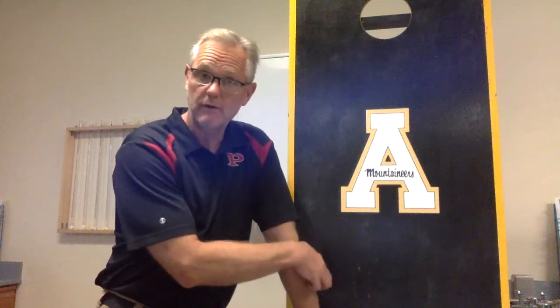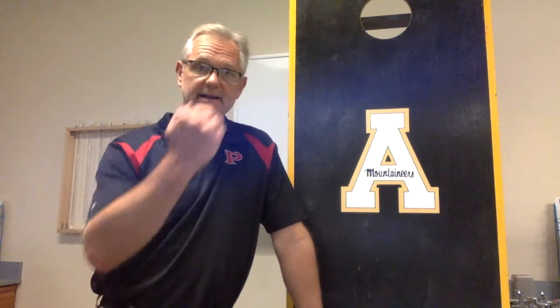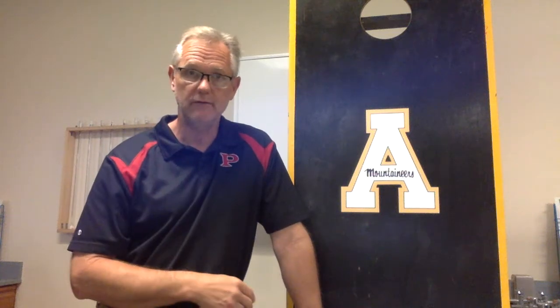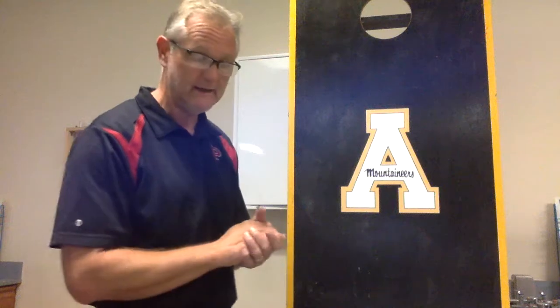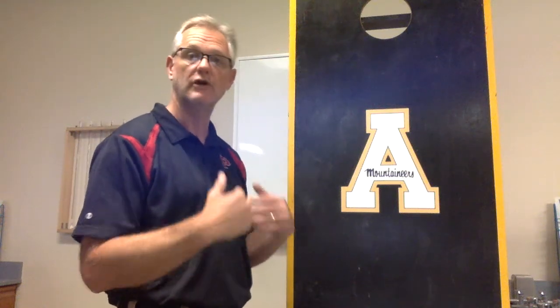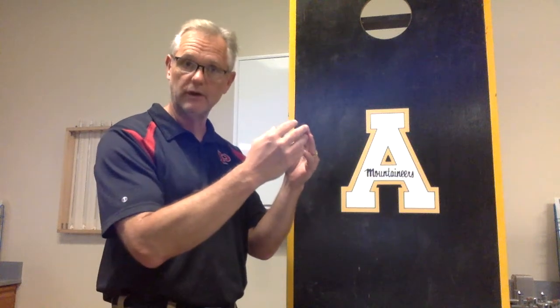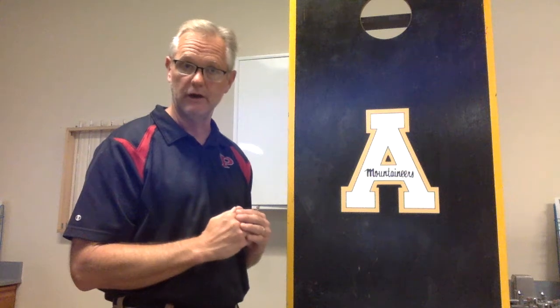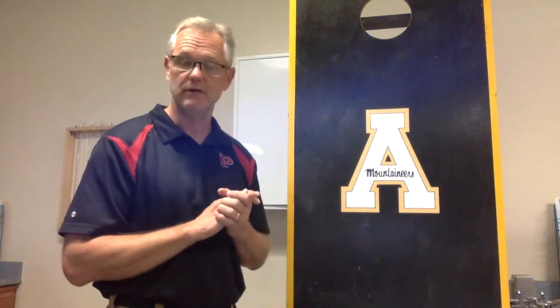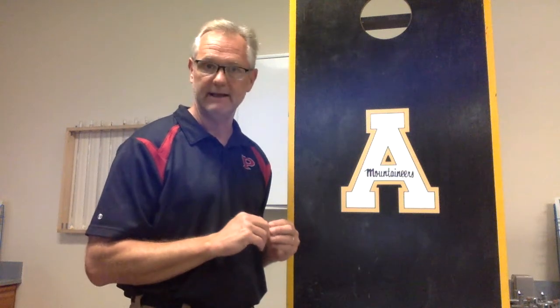Okay, in this lab, we're going to focus on the energy that is released as the electrons move from energy level to energy level. We're going to use a Bunsen burner to supply that energy to make the electrons move up in energy levels. And then those electrons will naturally fall back down. When they fall back down into these lower energy levels, they release energy, and the way they're releasing this energy is as light energy.